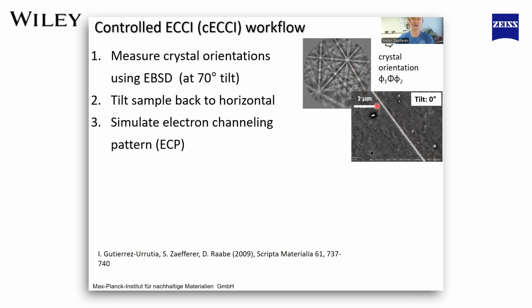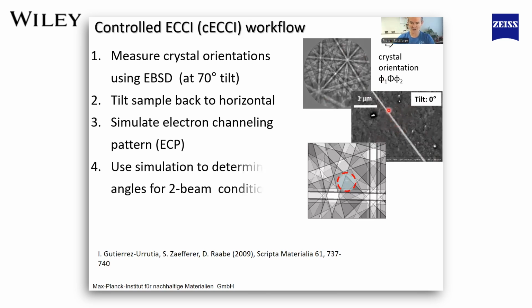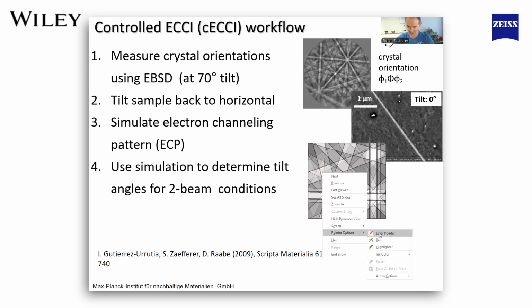Then we simulate, using this computer program Toka, the diffraction pattern for this condition here, for the untilted condition. And actually we can, oh, this will not work here. Wait a moment. I need the laser pointer off.